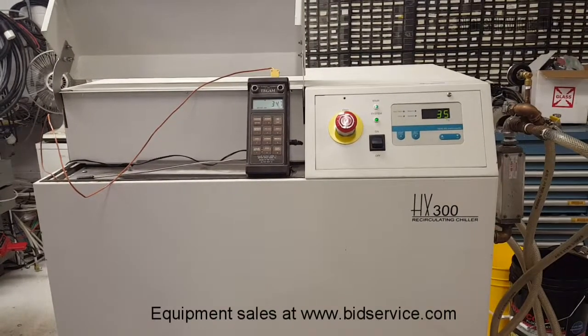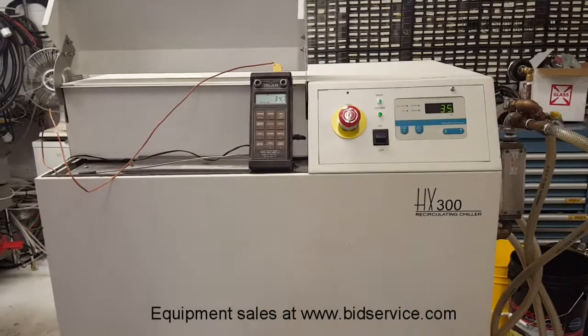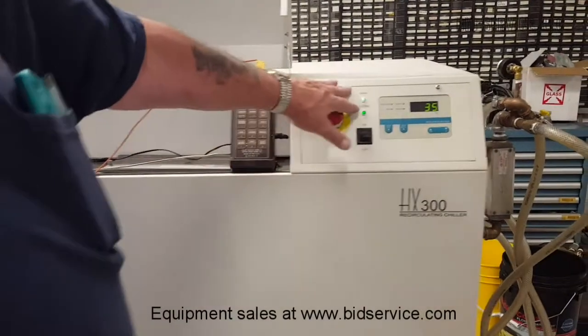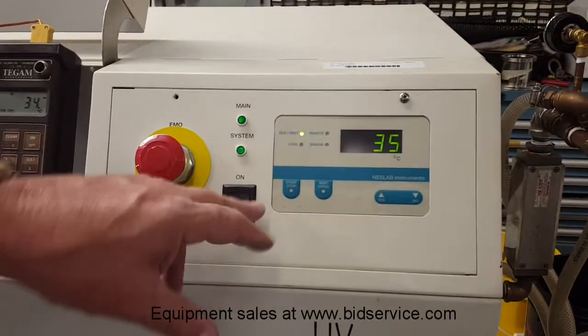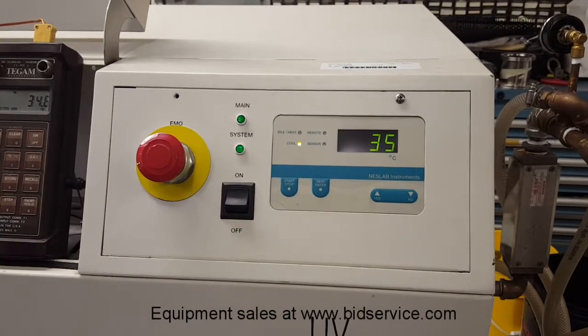This is the Nest Lab HX-300 recirculating chiller. It is fed by an input of 208 volts, it is three phase, and it is phase sensitive. If the phases are incorrect and you have your main light lit and you go to turn it on and hit start and it doesn't start, it's because you're out of phase and you'll have to switch one of your input lines.